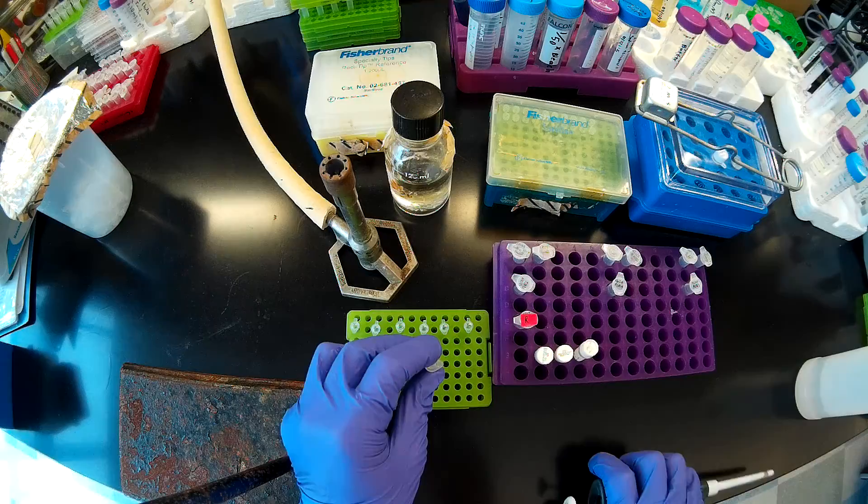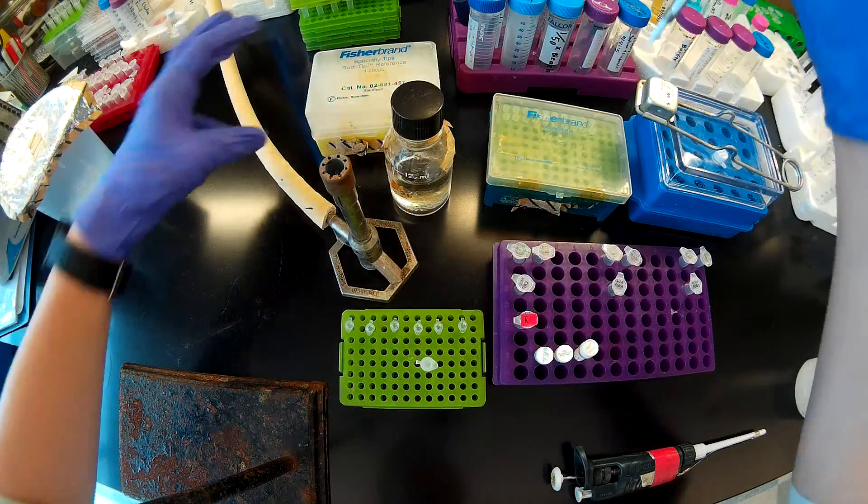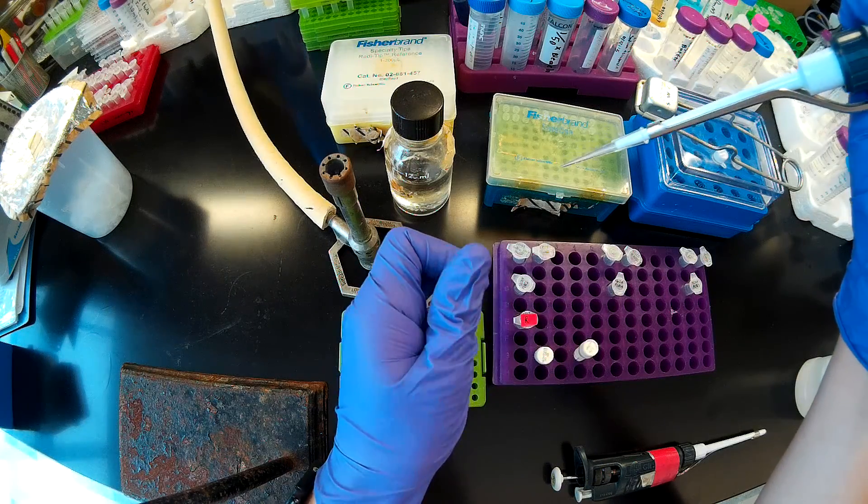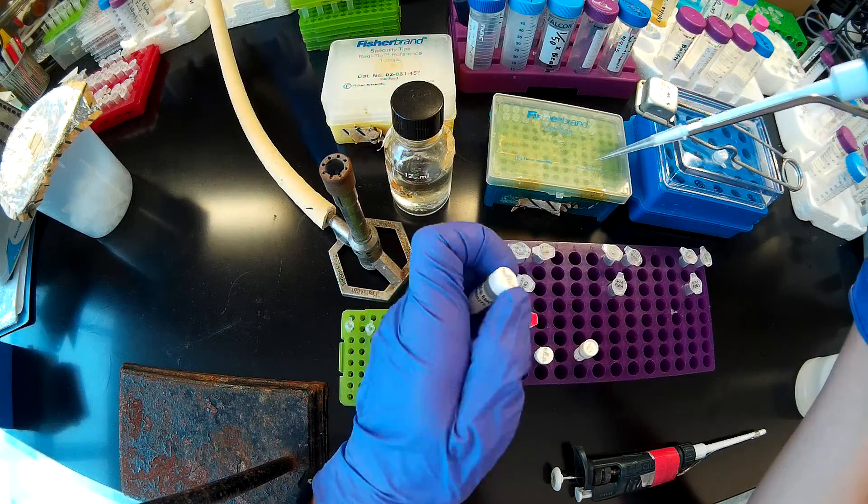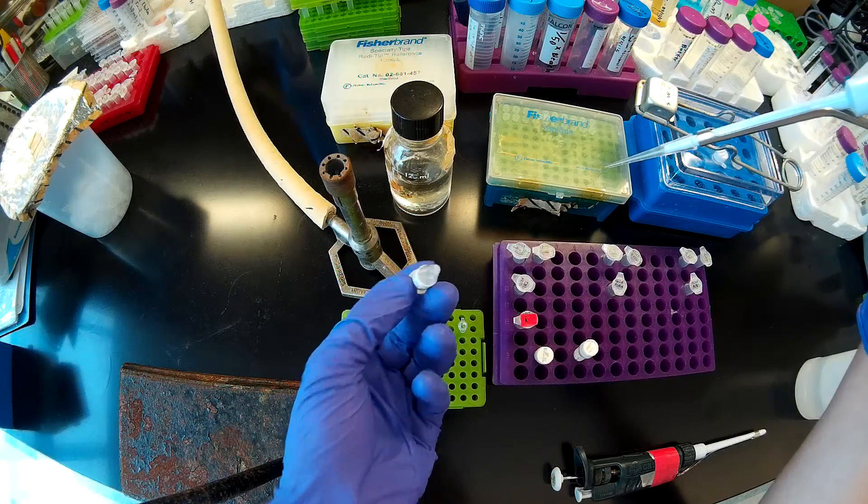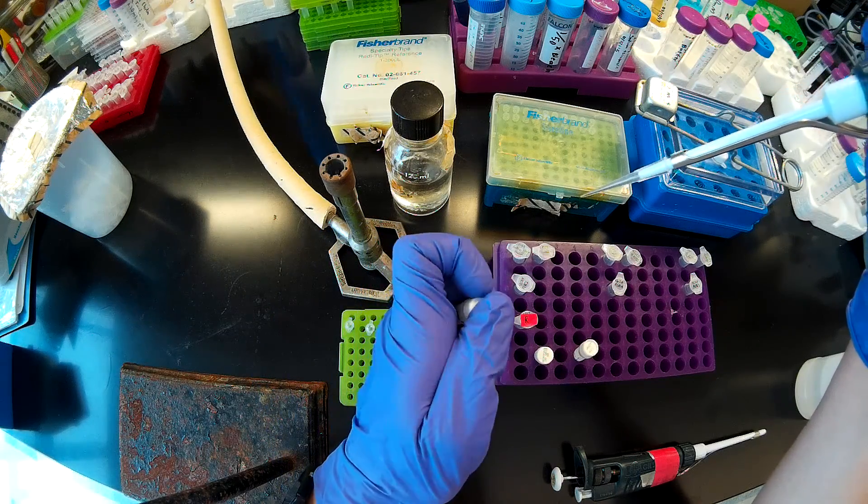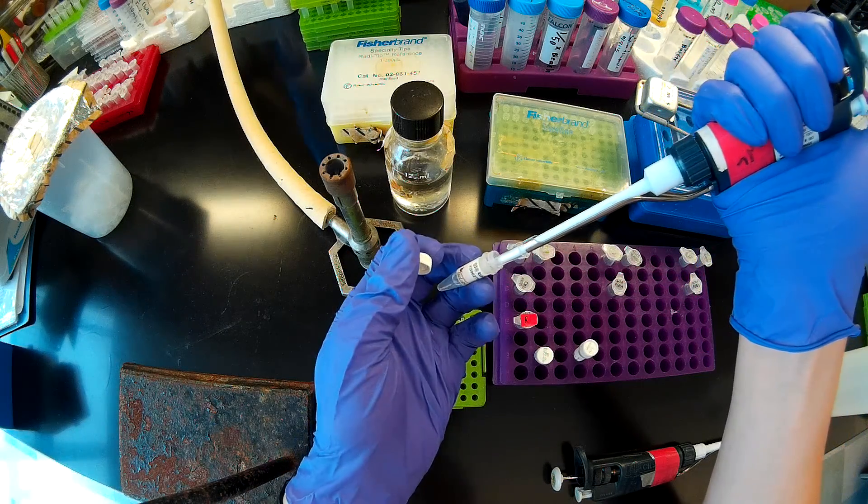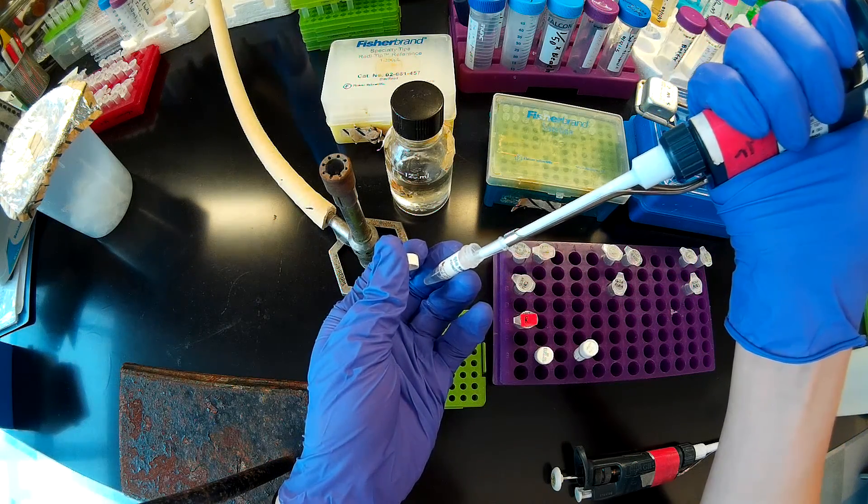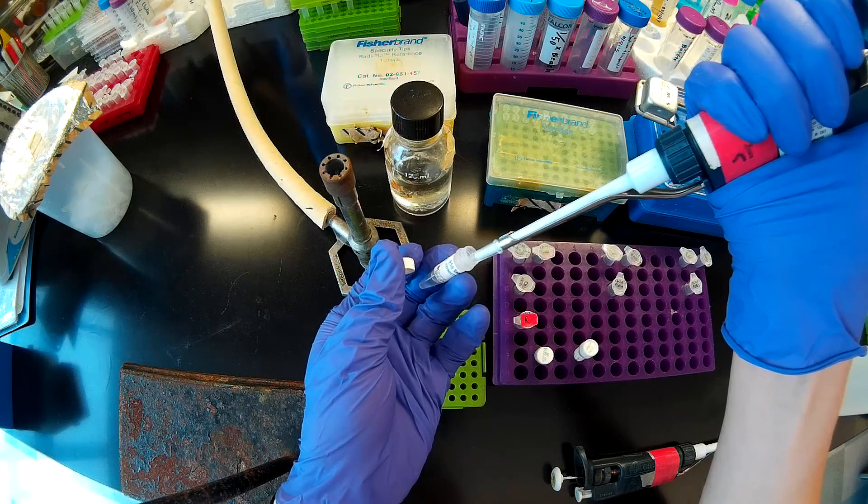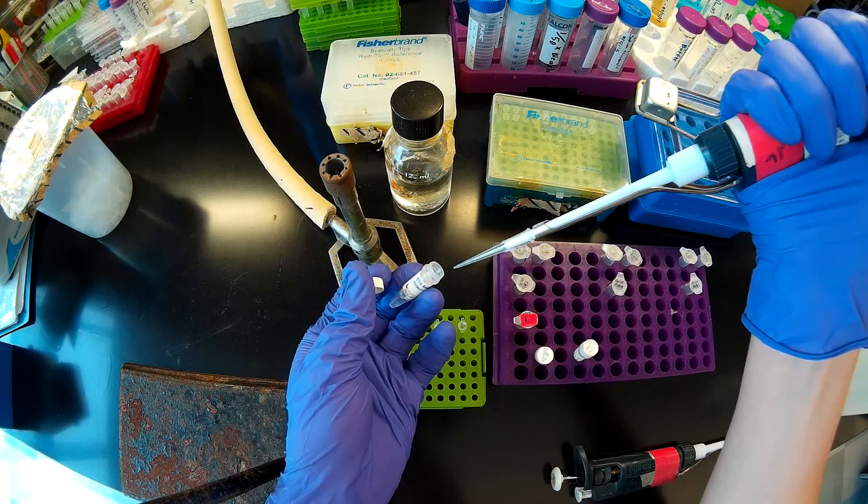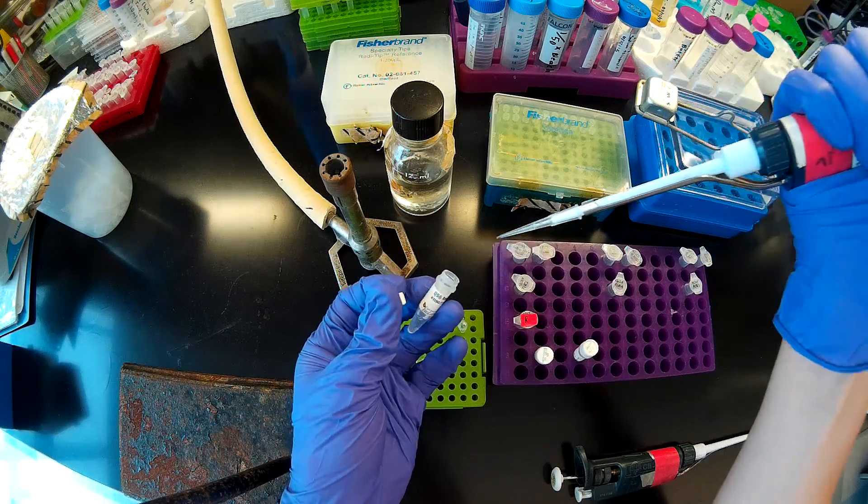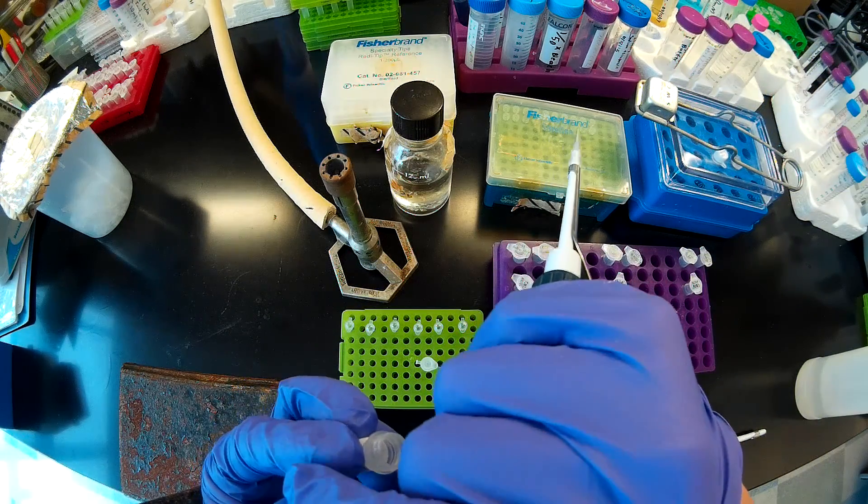I'm going to take 62.5 microliters of this Q5 reaction buffer. It's really important to make sure that this is well mixed after you pull it out of the freezer. The Q5 reaction buffer, some of the salts tend to precipitate out upon freezing. So I already vortexed it, but I'm going to pipet up and down a couple times just to make sure that's properly mixed. Now I'm taking 62 microliters of that.